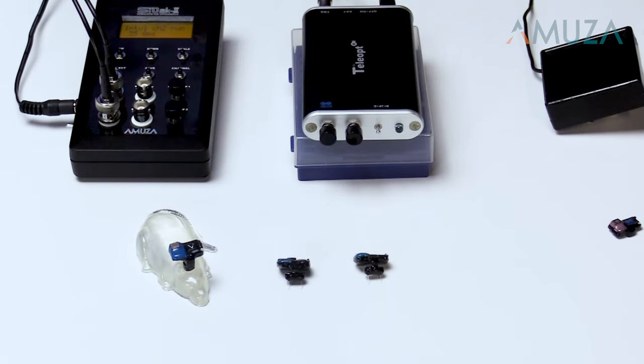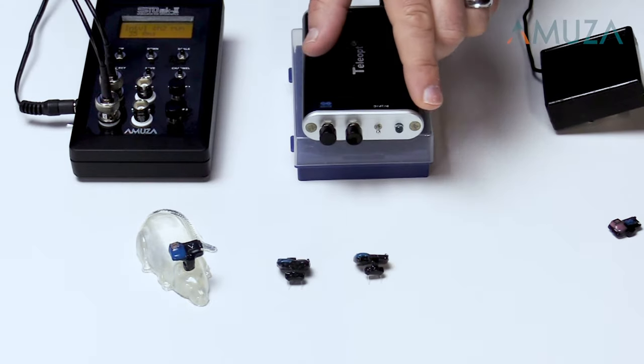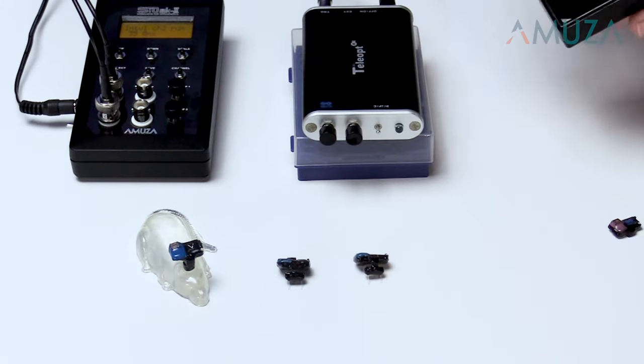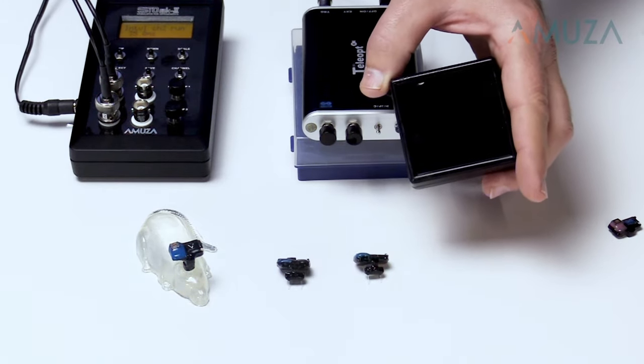Teleopto is great for scale-up. A single IR emitter can control multiple receivers on multiple mice and rats. With additional emitters, one remote can be used with multiple operant conditioning chambers.